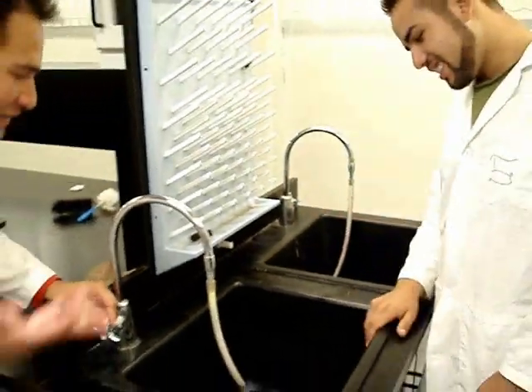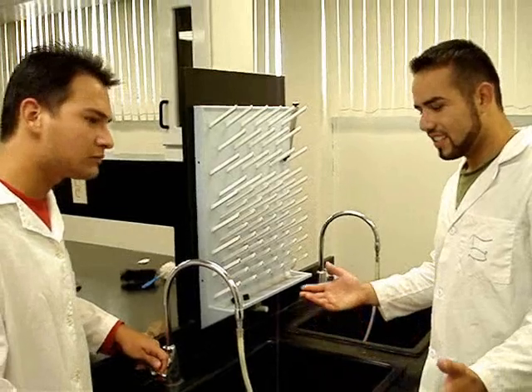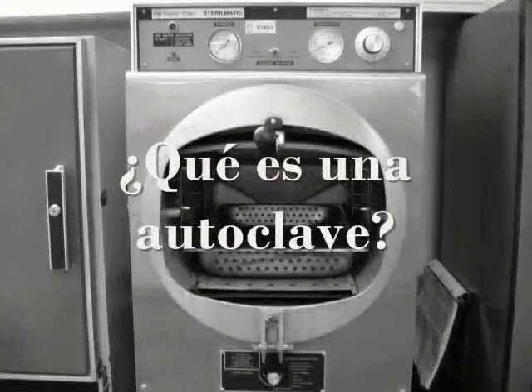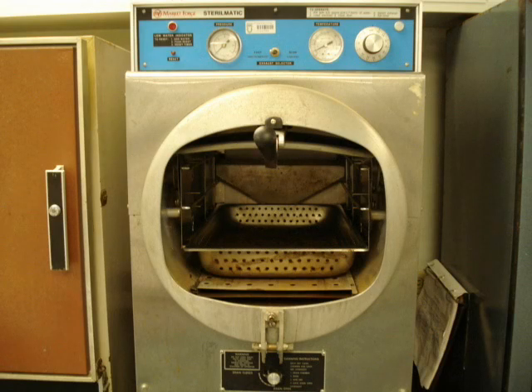The Autoclave is one of the most used equipment in laboratories. It takes care of sterilizing materials such as glassware and liquids, like agars and nutritious broths. It's not a pathogen, but materials still need to be sterilized.